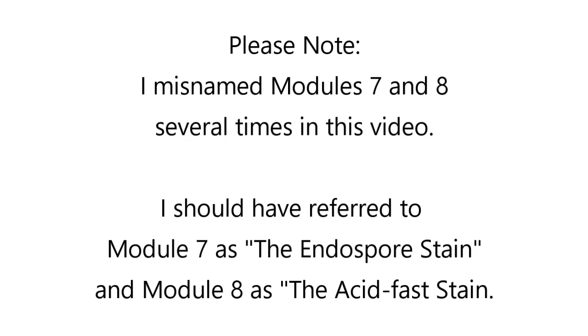Please note, I misnamed Modules 7 and 8 several times in this video. I should have referred to Module 7 as the endospore stain and Module 8 as the acid-fast stain.